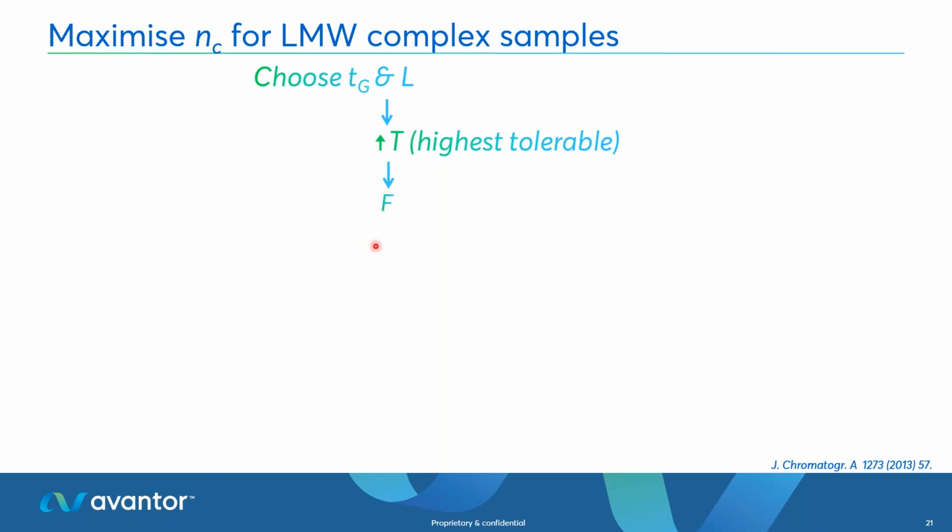Then here, if you were keyed in and you remember, push that velocity as fast as possible, please be reserved. Don't do that yet. We need to choose a reasonably sensible flow rate now, because the first decision, understanding that multivariate relationship, is, do we have the correct column length, yes or no?